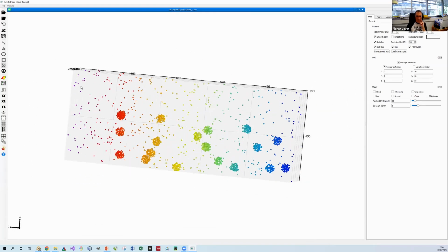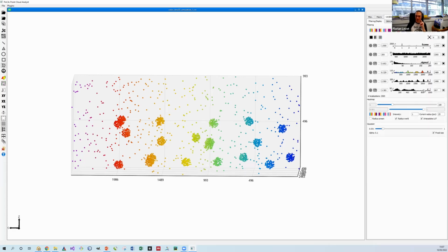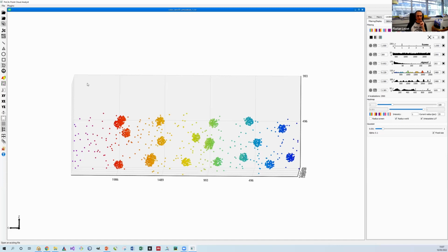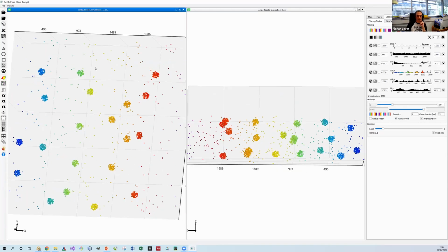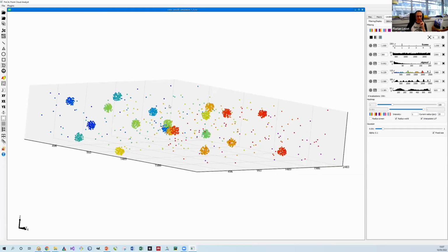So let's say that here I'm not happy with the fact that there is this whole empty space here. We can see that it is in the Z direction. So we go to the localization tab, we go to the Z, and we can see that indeed here there is almost no localization. So that's this part. We apply some thresholding, and then we can do the duplicate. So now indeed I get rid of all this blank space. I can close that and go here.